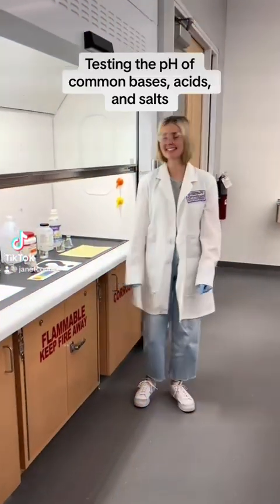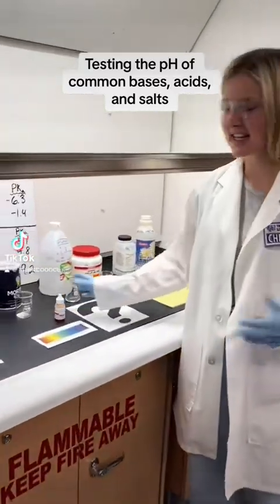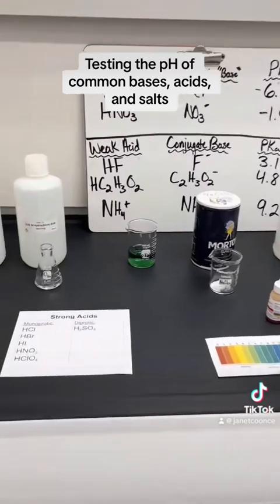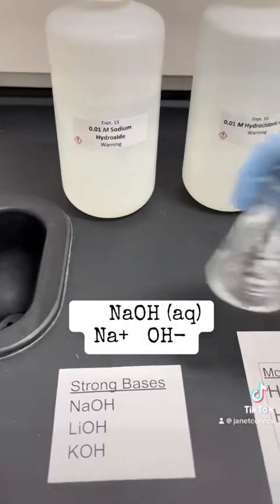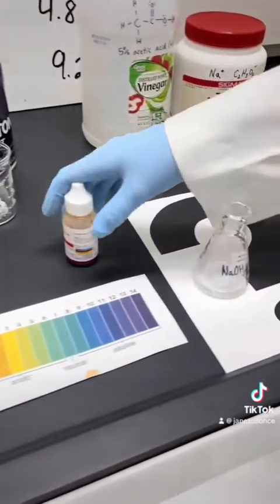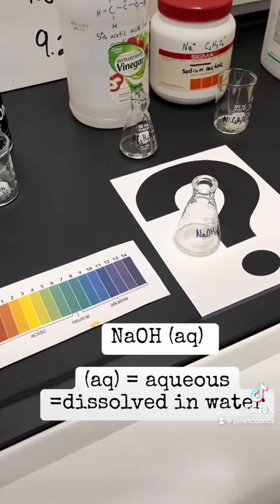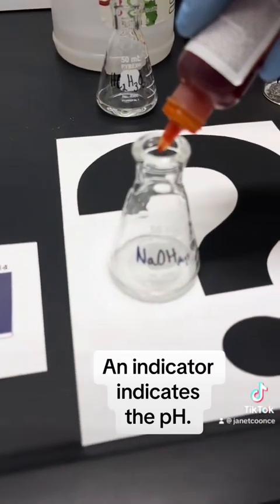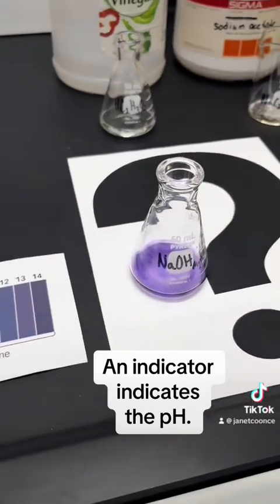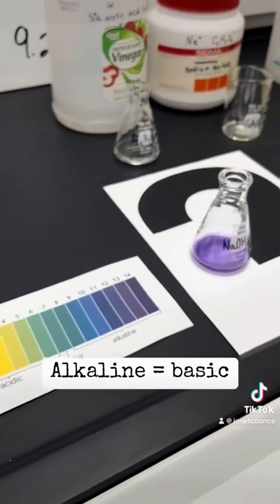Hey chemistry students, so today we're going to test the pH levels of different chemicals. So right here we have sodium hydroxide, and if we come over here we have this pH indicator. So we have universal indicator, and add the universal indicator to the sodium hydroxide and let's observe. Cool, so what can we tell?